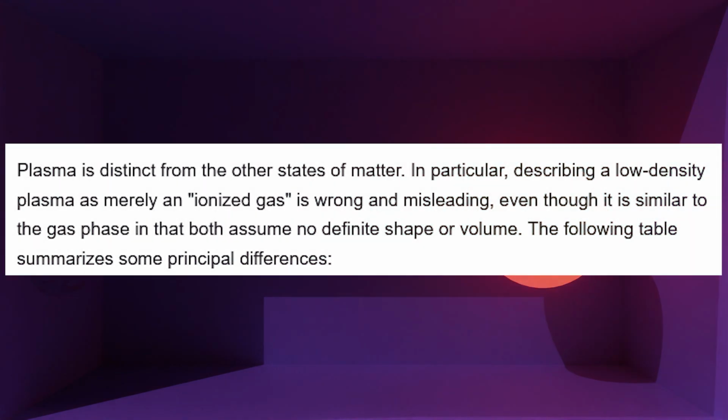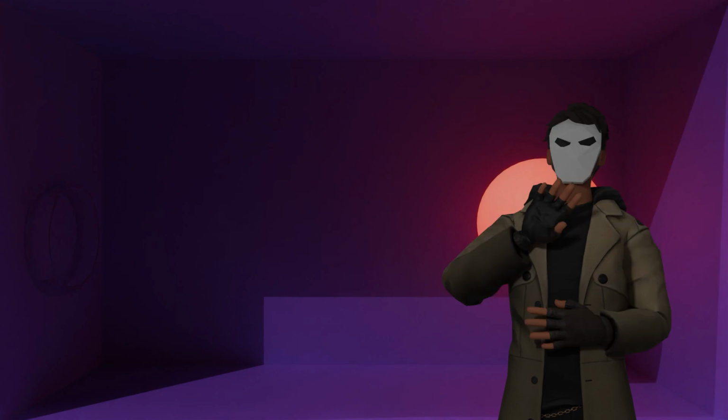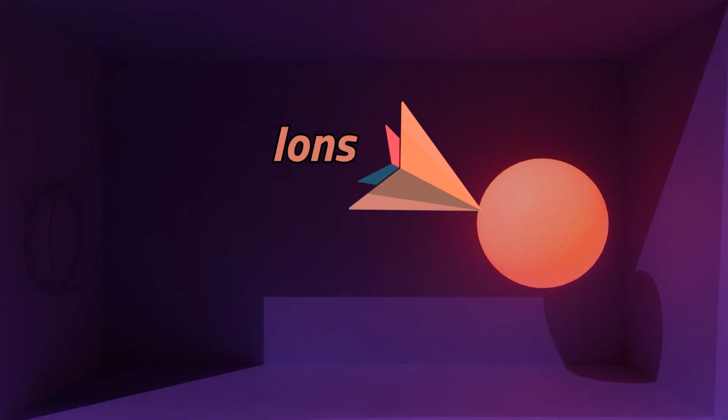Basically, plasma is just an ionized gas and... whoops. Okay, it's not really an ionized gas, but the states of matter is a story for another time. And so for the sake of the experiment, we mostly only care about it being ionized, so trust me, it's good enough in this case. That's why the highlight of this chamber really is gas molecules in, ions out.